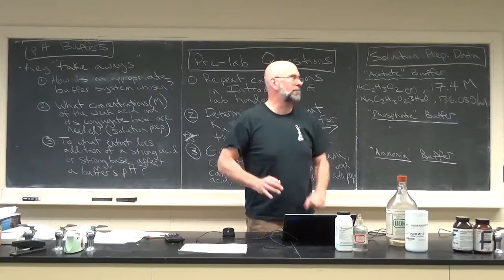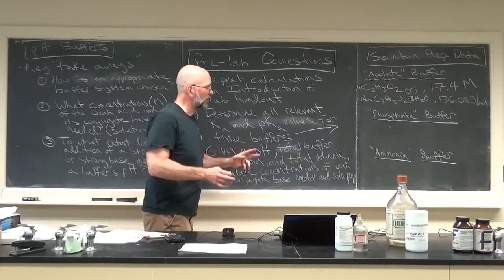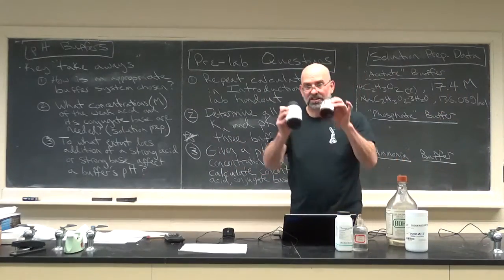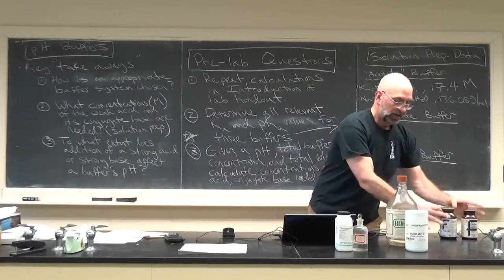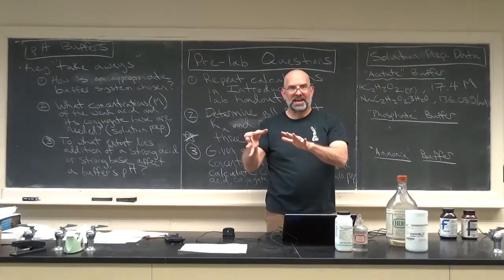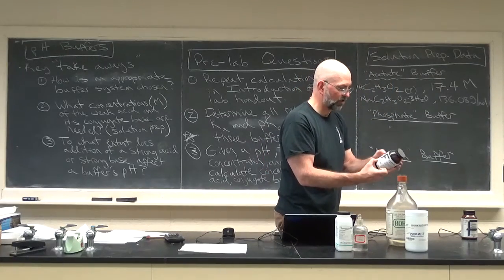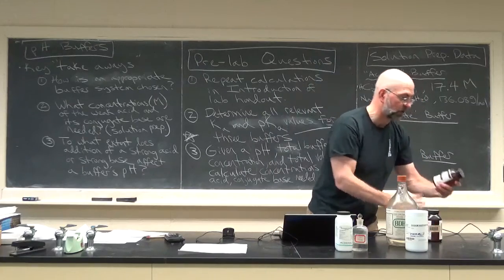So that's solution prep. The phosphate buffer. Okay, the phosphate buffer, I put that in quotes because it's not exactly, it's actually two different solids. It's interesting. One solid is the acid, the other solid is the base, and I'm just going to put these two down here. So the first one is actually the base. Let me give you the acid first.